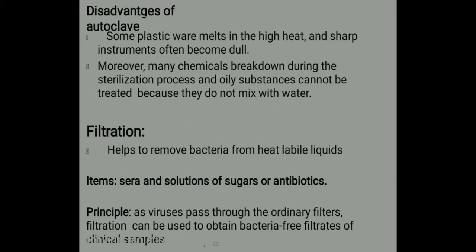Next we have filtration. It helps to remove bacteria from heat labile liquids, sera, and solutions of sugars and antibiotics. Talking about the principle, as viruses pass through ordinary filters, filtration can be used to obtain bacteria-free filtrates of clinical samples.